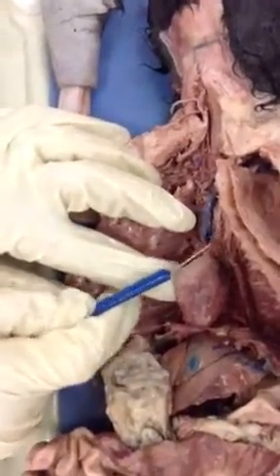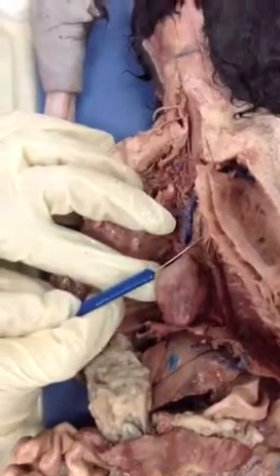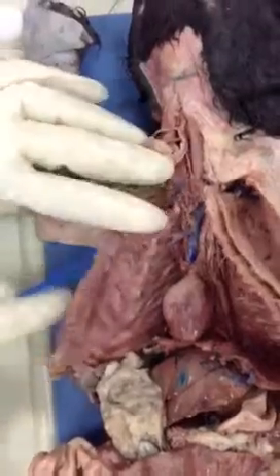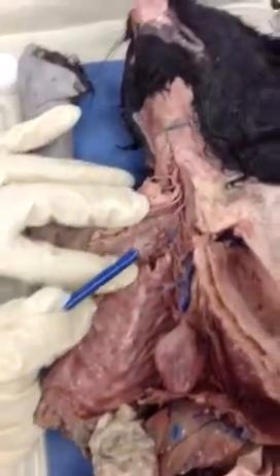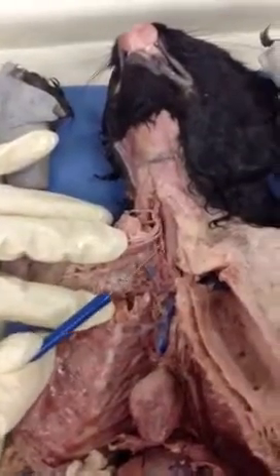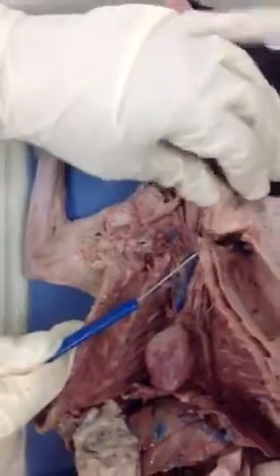Brachiocephalic. And then this is the? Left carotid. No, the left subclavian. Very good. Now, the brachiocephalic gives me branches. I see that this is the trachea. Parallel to it, I see this blood vessel. So this must be what? Right common carotid. Very good.